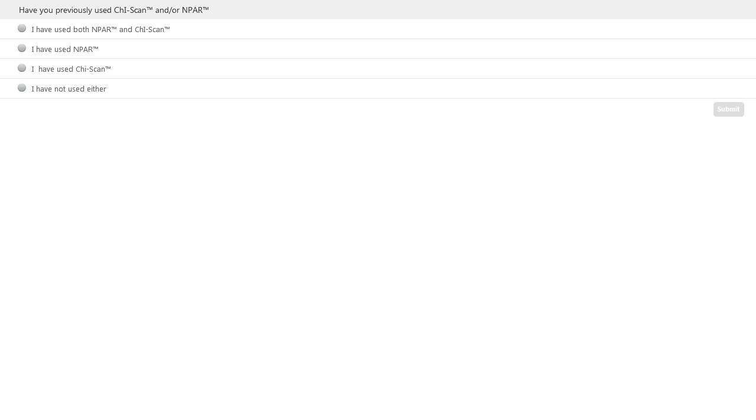I use NPAR quite a bit. People don't send me easy things, right? It's the nature of the job. If everybody sent me steel samples, I'd be very happy, but I tend to get weird research-grade ceramics with 15 phases in them, and NPAR really changes how you do things.